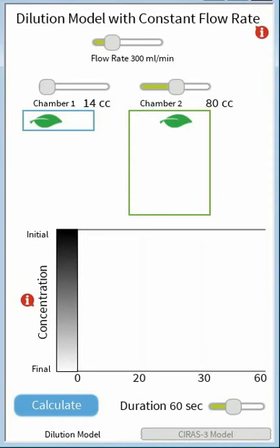Size and cuvette volume really matter in getting fast gas exchange measurements from systems. This calculator will help explain why.